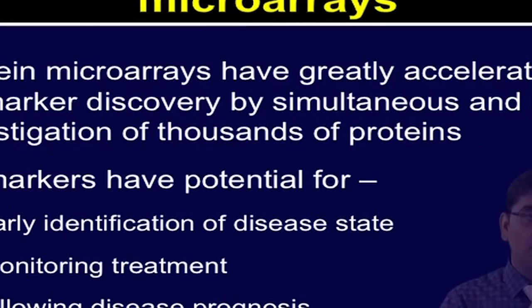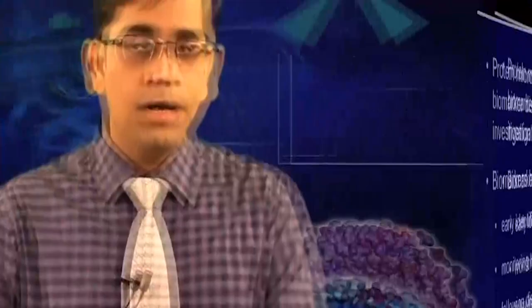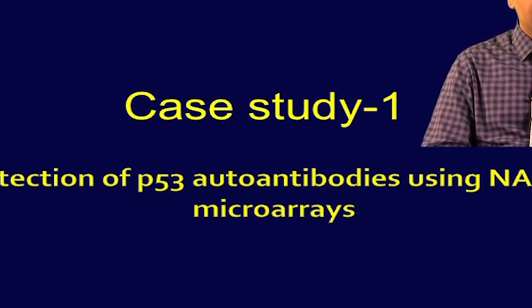So, biomarkers have potential for early identification of disease state, monitoring a disease treatment response, as well as follow up on the disease prognosis. Let us look at how cell-free expression based microarrays have been applied for screening of biomarkers. Let us discuss our first case study for this lecture, which is detection of P53 autoantibodies in human serum using cell-free expression based NAPA microarrays.